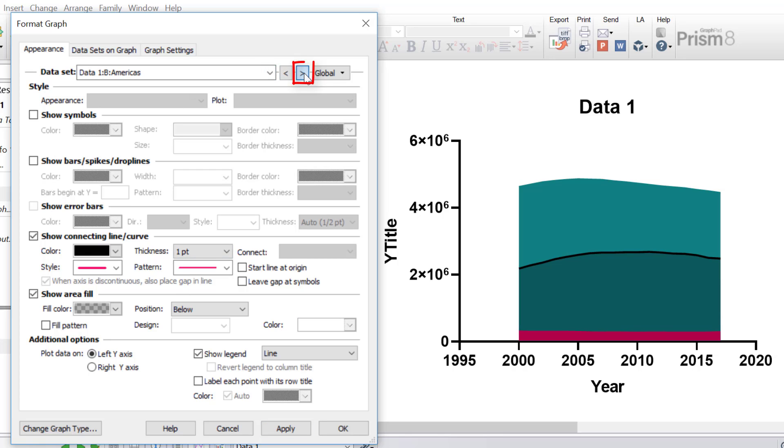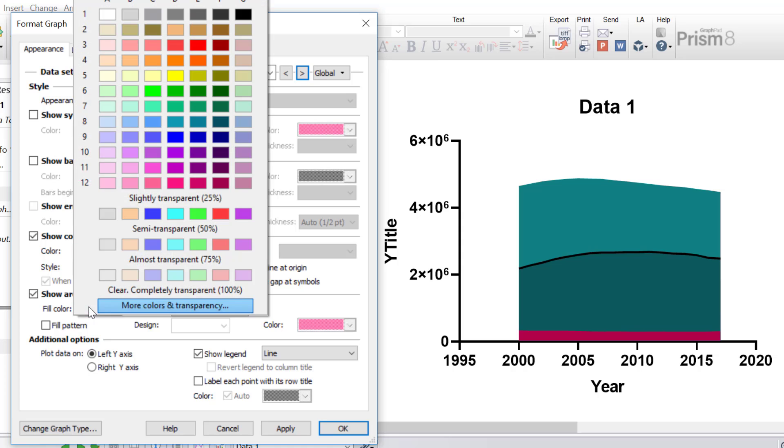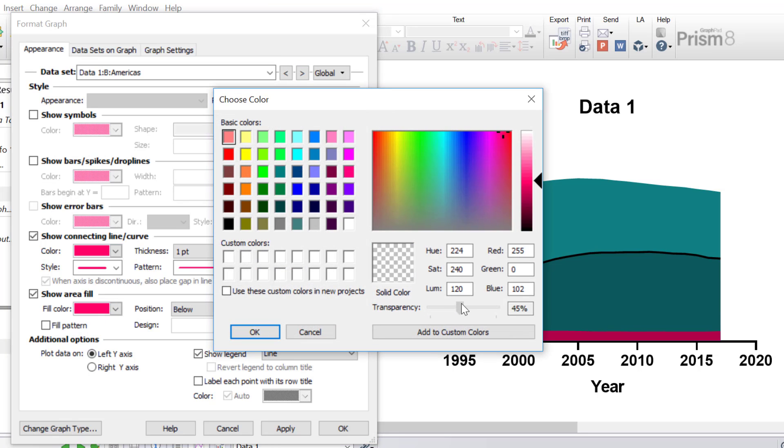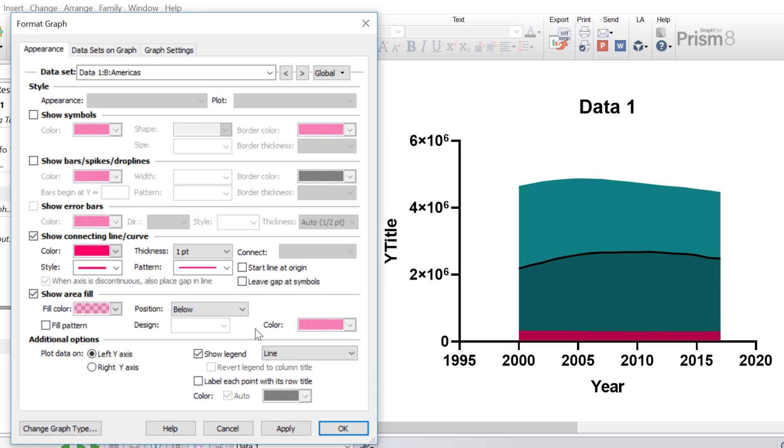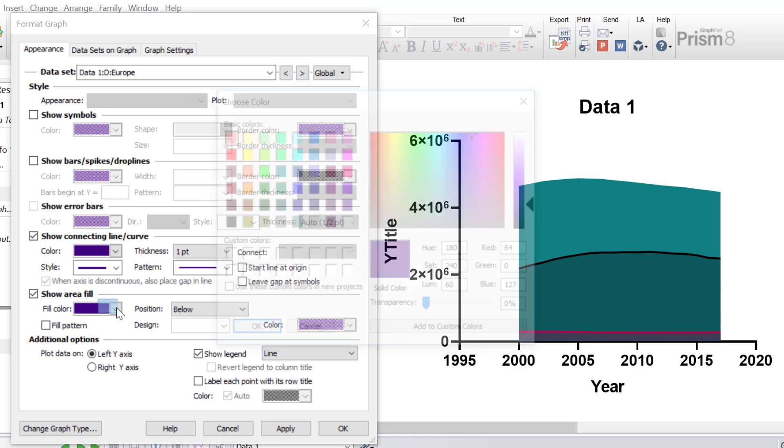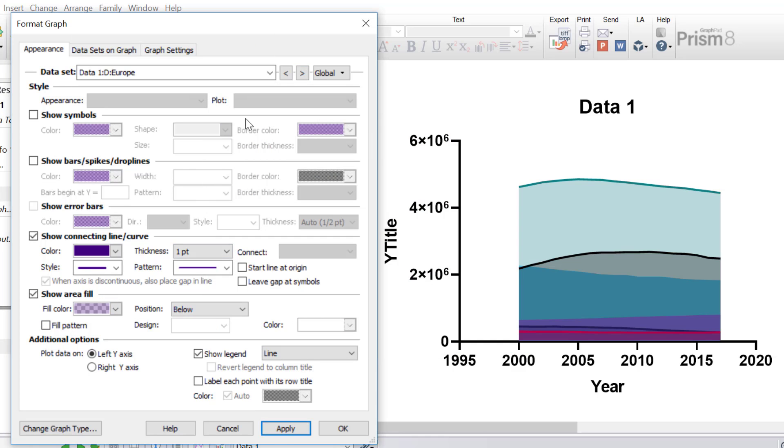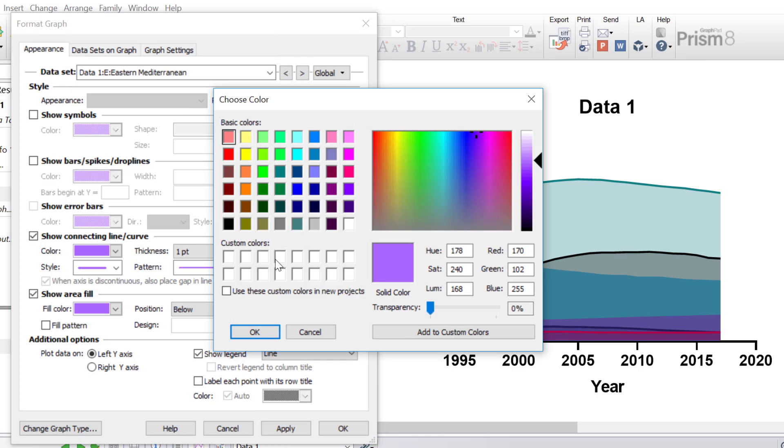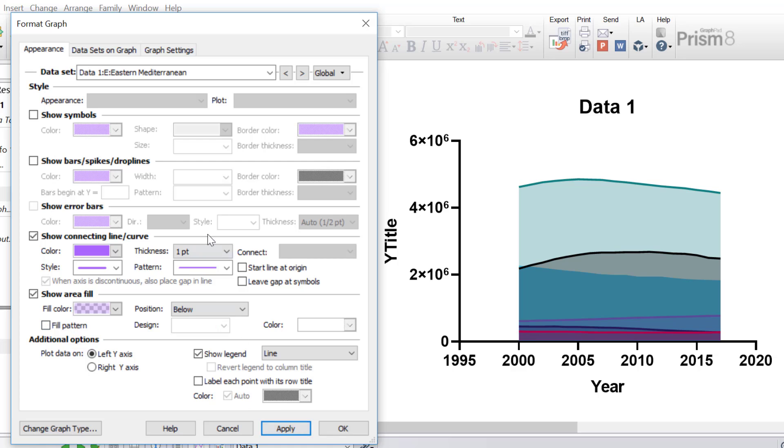So I'm going to toggle to my next dataset, which is the Americas dataset, and I'm going to do the same. I'm going to change the fill color Transparency to be 70%. Click Apply. So that's the Americas done, and I'm now just going to proceed and change the transparency of each of my datasets to 70%. So I've now changed the area fill of each of my datasets to have a 70% transparency option. So now we can actually see all of the lines and all of the areas for each of the datasets, which is brilliant.